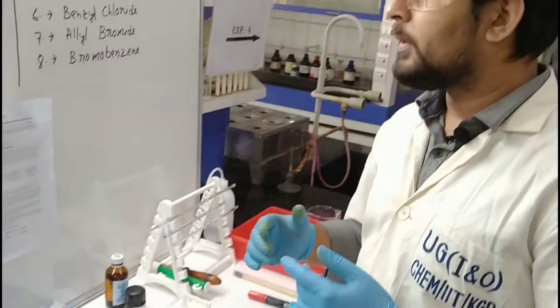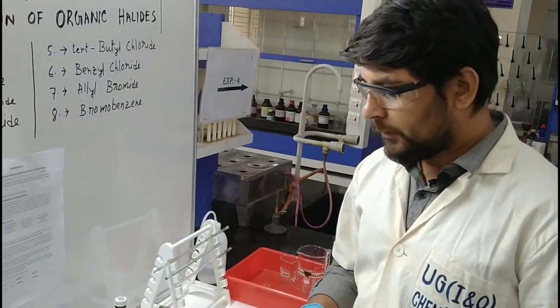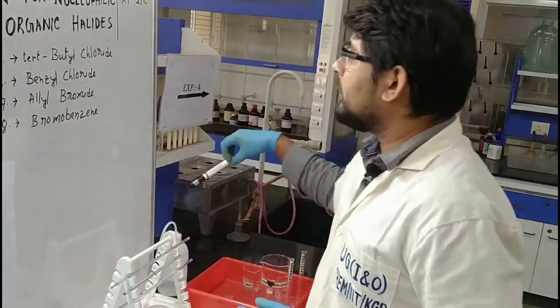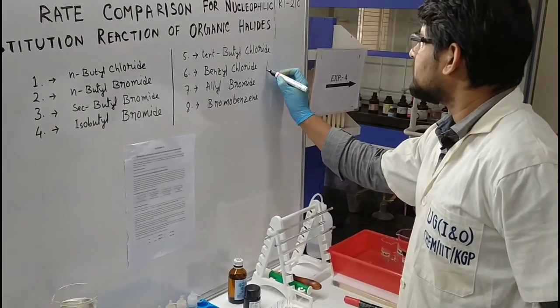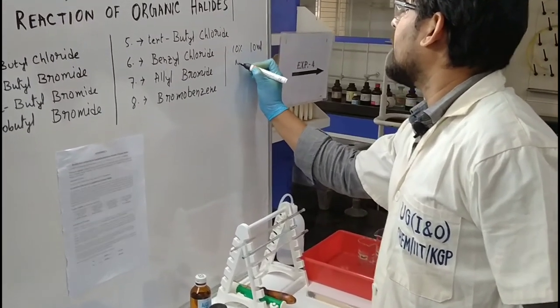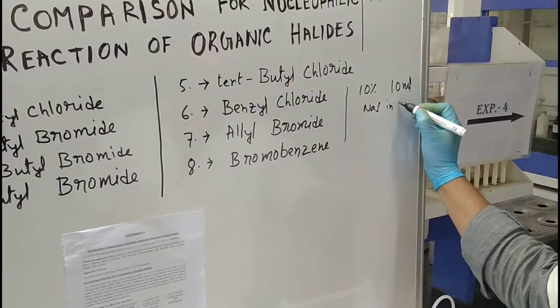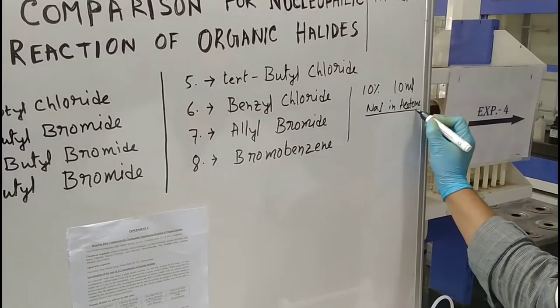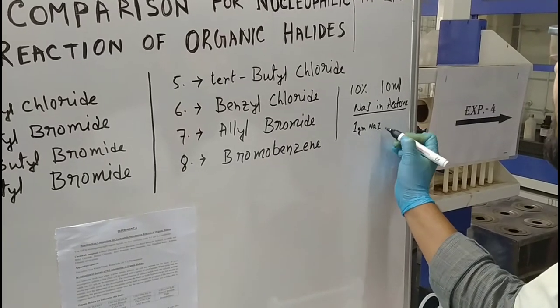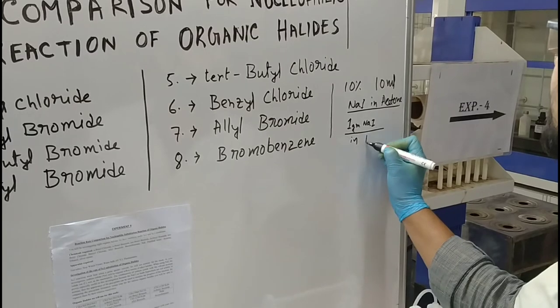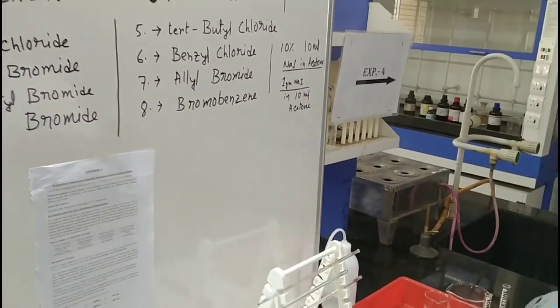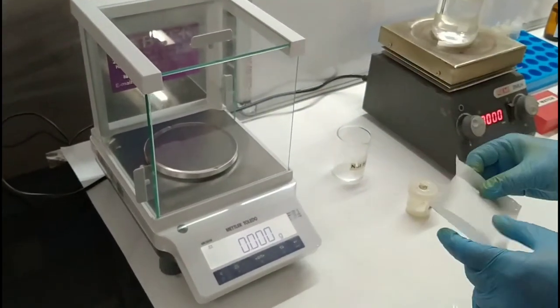Eight test tubes are required for 8 halides. First we are going to prepare the NaI solution. 10% NaI means 10% NaI in acetone — that means 1 gram NaI in 10 ml acetone. We have to weigh 1 gram NaI using the weighing machine.